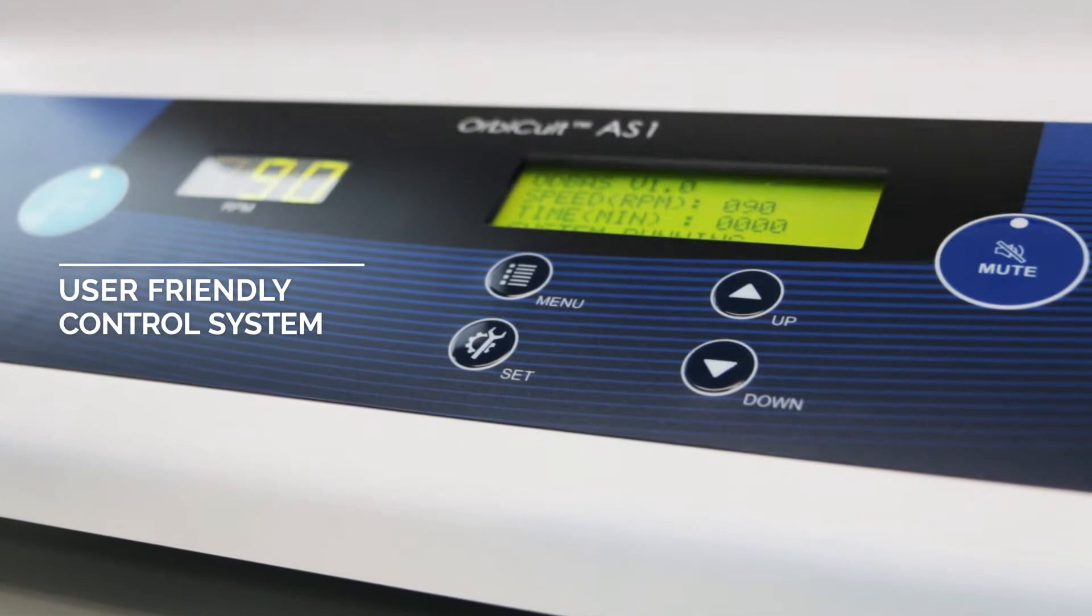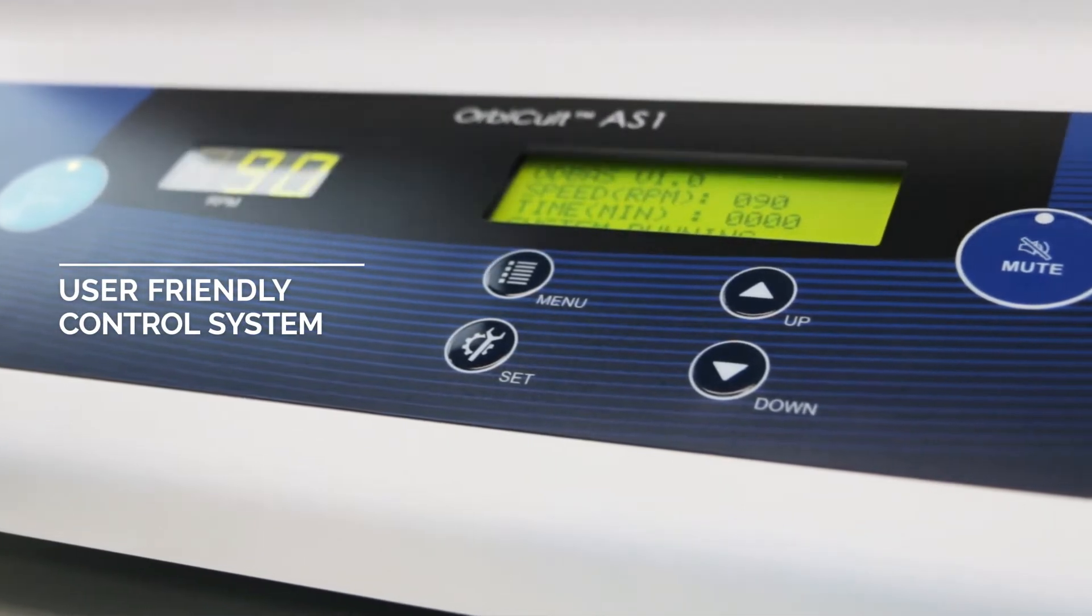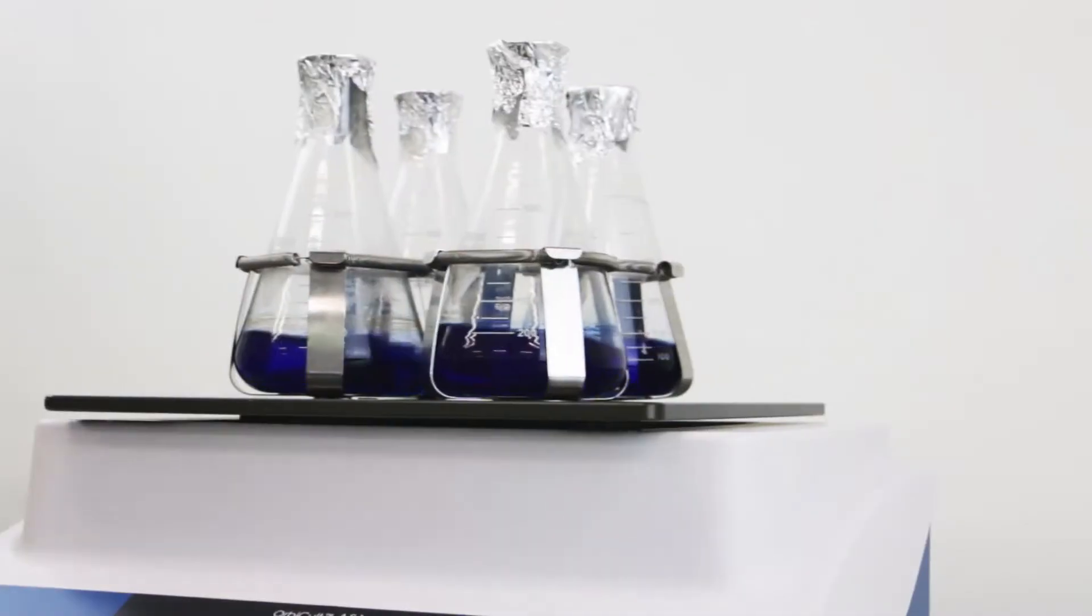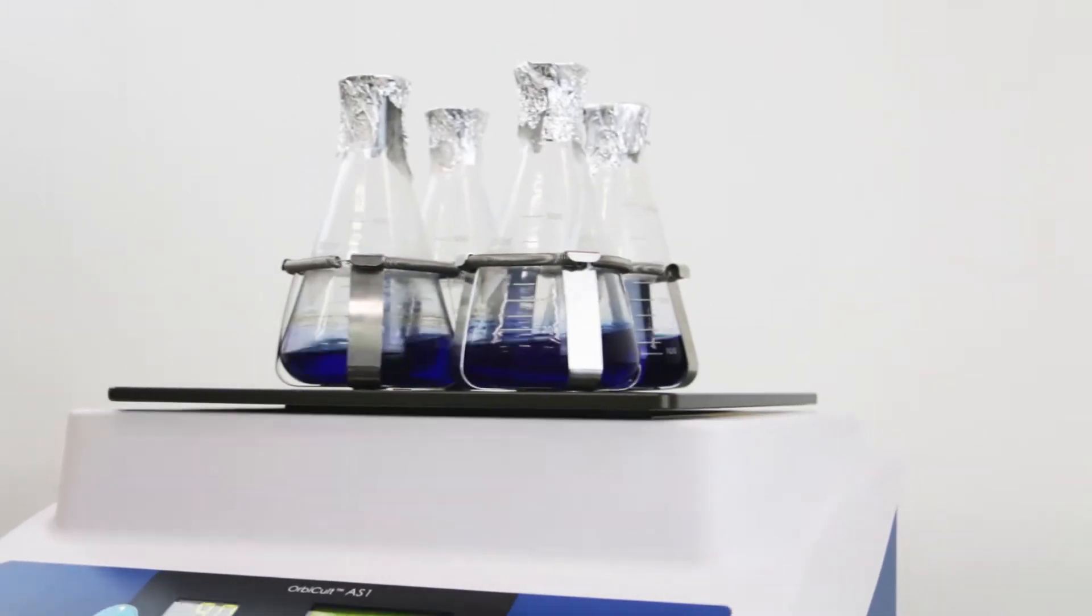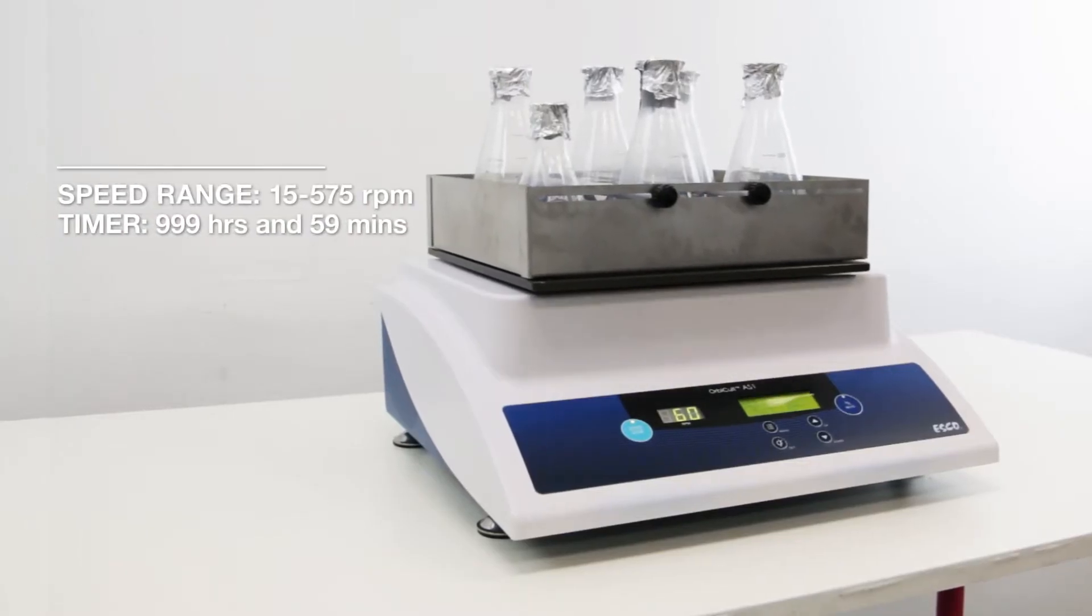User-friendly control system that displays all information simultaneously on the screen. The OrbiColt Ambient Shaker is capable of operating between 15 to 575 rpm with a time range of 1 to 999 hours and 59 minutes.